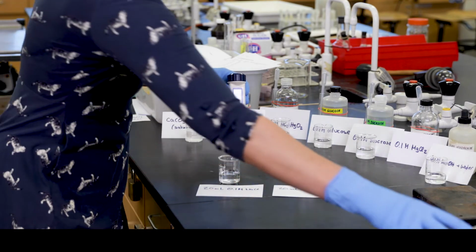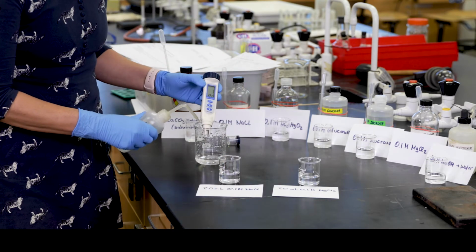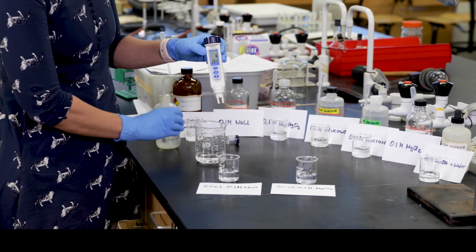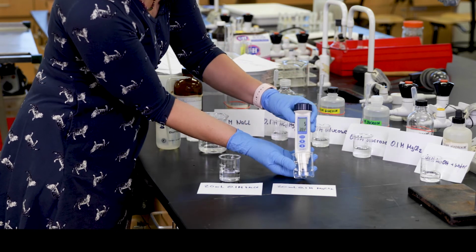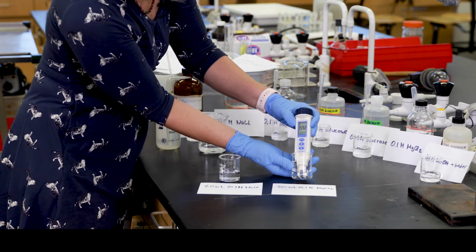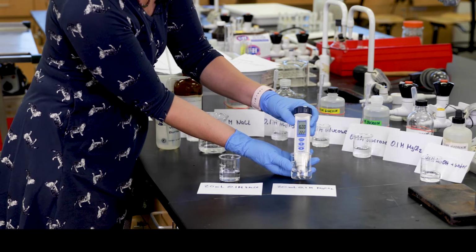And we're going to now also measure side by side 20 milliliters of the same concentration magnesium chloride solution. Oh, that's higher. That's 15.96 millisiemens.